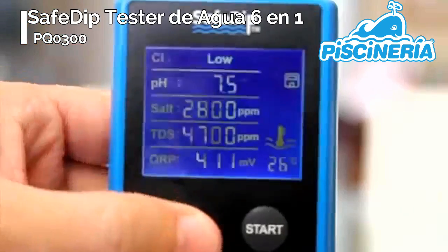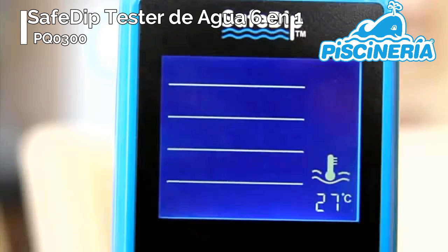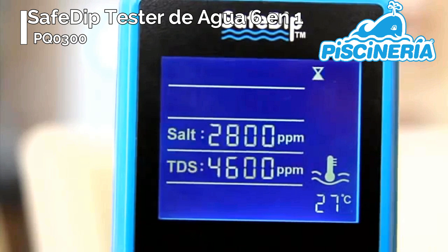Press the on button and then press the start button to begin the testing sequence. You will know when a value has been reached for each test when the number stops blinking. The entire test sequence should take less than a few minutes.